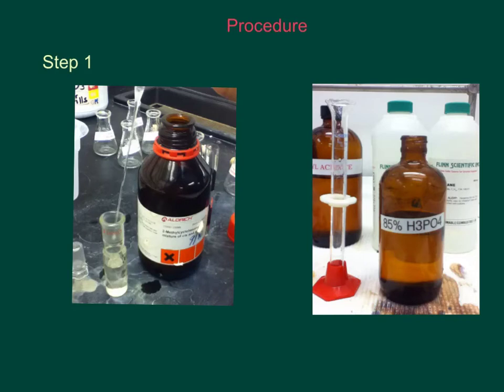In the first step of this experiment, we're going to place in our 5 mL conical vial 1 mL of 2-methylcyclohexanol and 2 mL of 85% phosphoric acid, as well as the spin vane. So here we have our 2-methylcyclohexanol and our 85% phosphoric acid.